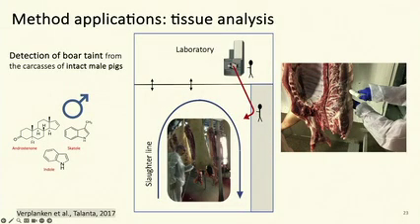Now, going back to the tissue analysis, this was a big project involving the meat quality, or specifically pork meat quality, because when you raise male pigs, and the male pigs are not castrated, there is a slight chance that the meat will have a very distinct unpleasant smell, and it's very difficult to measure it before you slaughter the pig for meat. And it needs to be assessed very quickly and very reliably on the slaughter line.